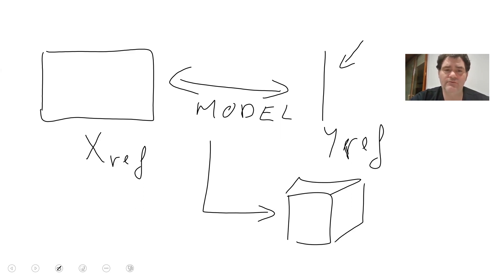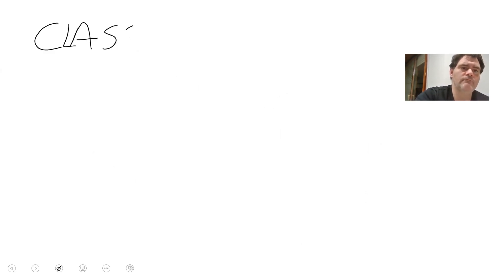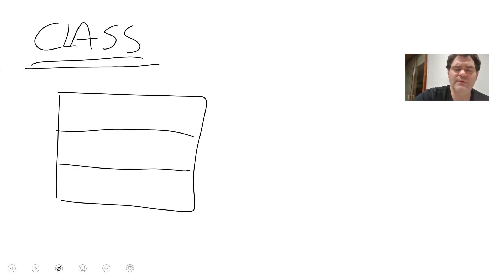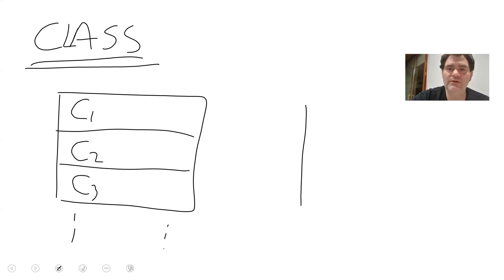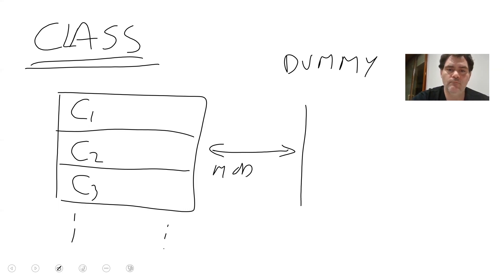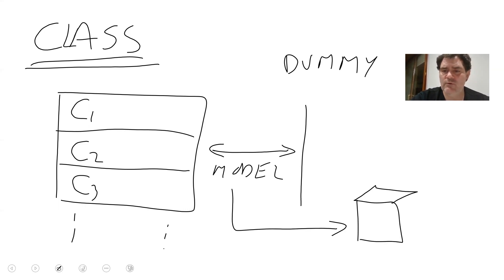So these are the two stages we have to face. In the context of classification, this X matrix should be formed by consecutive spectra of the different classes we want to classify: class one, class two, class three, etc. Our Y reference will be created automatically in Hypertools as a dummy matrix if we need it, because we have methods like SIMCA in which we don't need it. Then we create our model and predict whatever class we want in our hypercube.